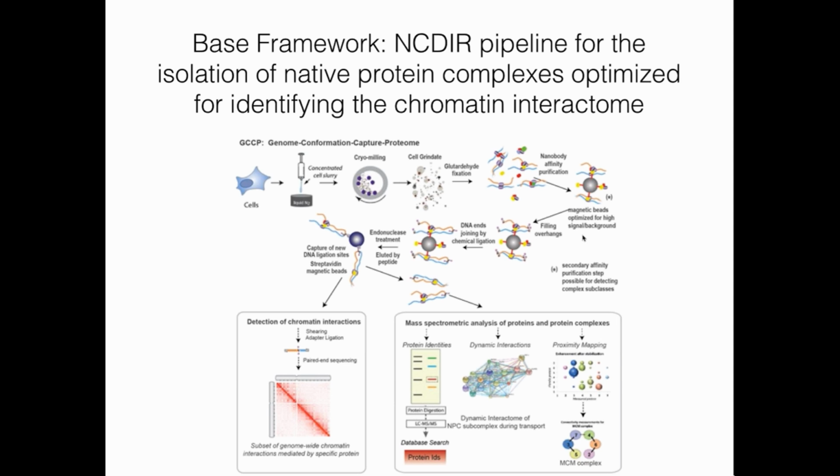So we were somehow getting aggregations of things that didn't contain lac repressor with other pieces that did. So you mentioned the large aggregates. I'm wondering what the size of the small pieces are and how you try to minimize those small pieces coming together to form aggregates.